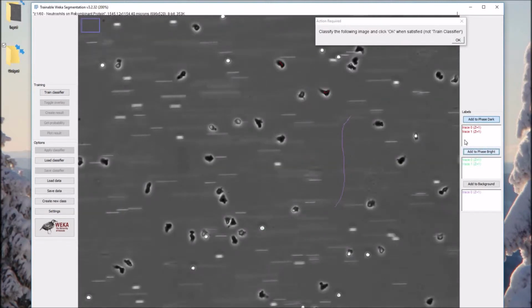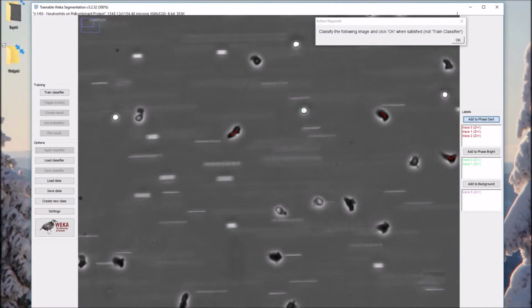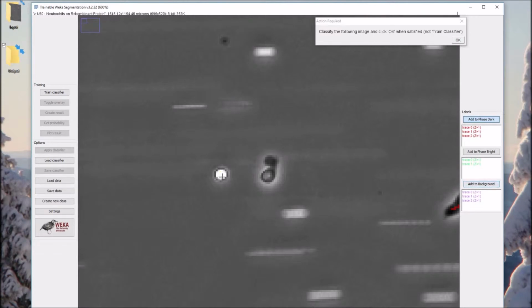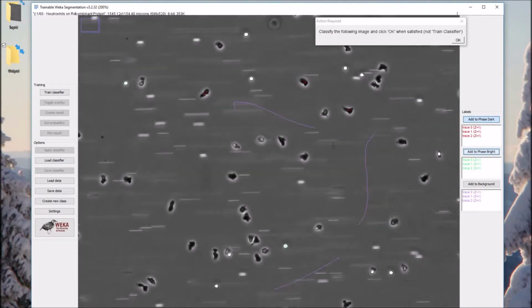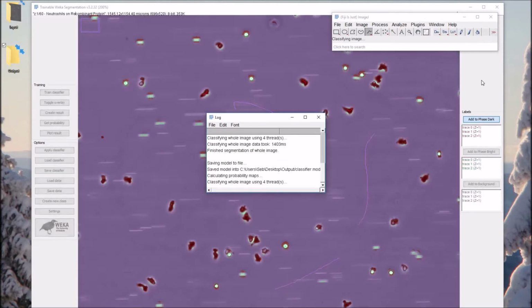If the items you are trying to trace are too small, use Control and the scroll button on the mouse to zoom in to particular places of your image. Continue until you have all the traces you desire. Once you are done drawing the traces and classifying the traces into appropriate categories, click the OK button. This will now run the trainable segmentation. This window will pop up.